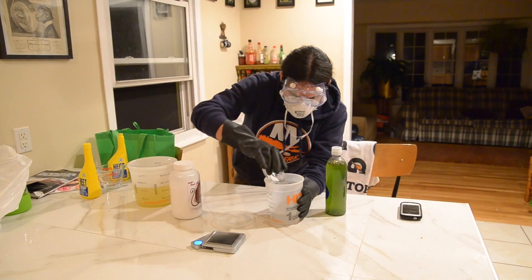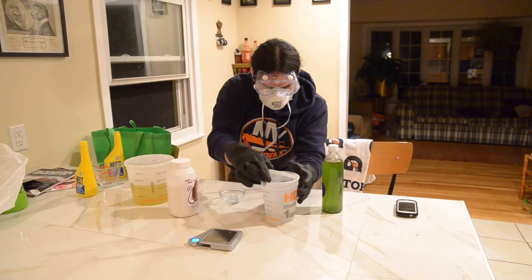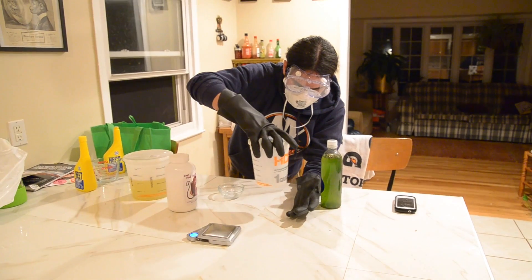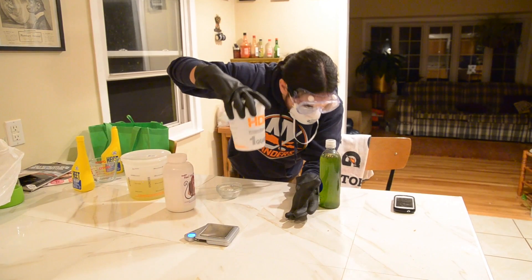So, 5 grams of sodium hydroxide in 200 milliliters of methyl alcohol. Close it tight, and then just swirl it around. It should fully dissolve in a minute or so.